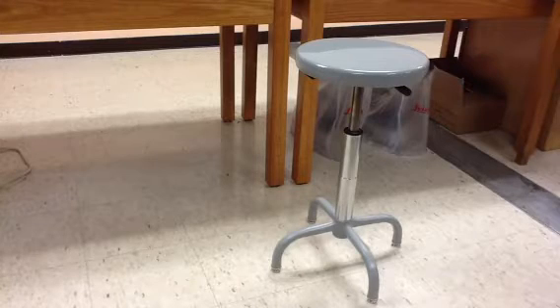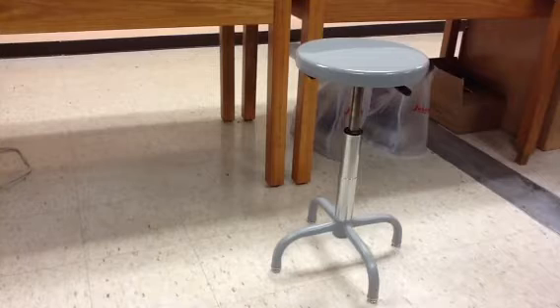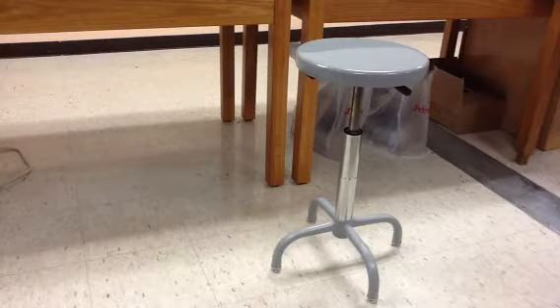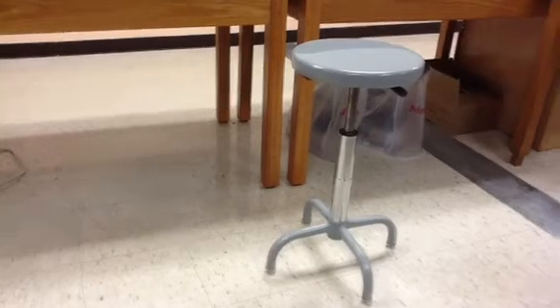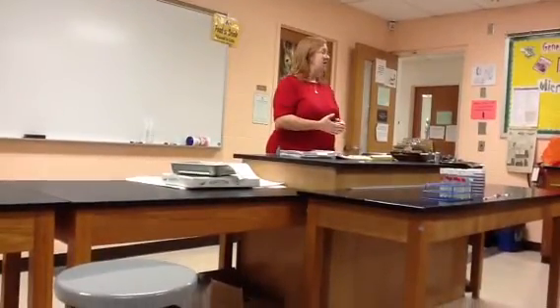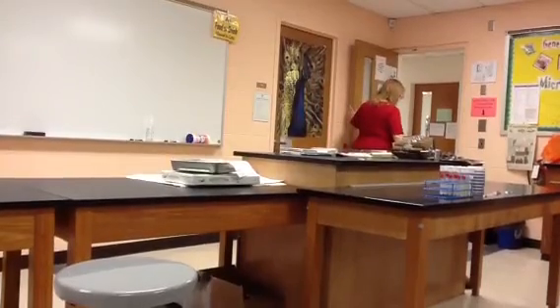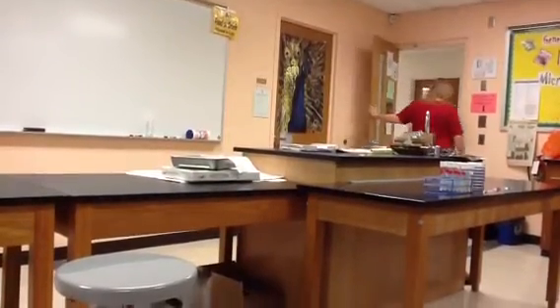97, metabolic activity is just in front of lab 15, which is the first lab we're doing today. This sort of gives you the background for what we're doing in the rest of the semester. So the first half, you became familiar with what microbes look like under the microscope. You learned aseptic technique, how to inoculate, how to get isolated colonies. That's basic lab procedure. From now on, we're going to focus not so much on procedure. You've got all that down.